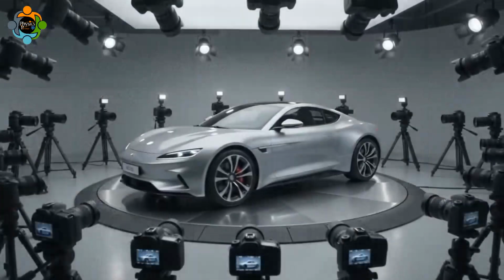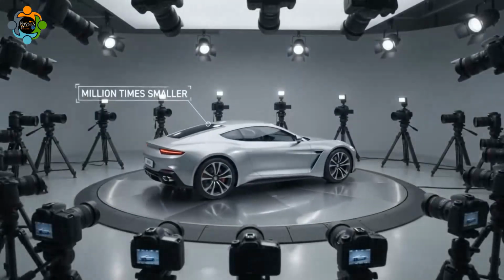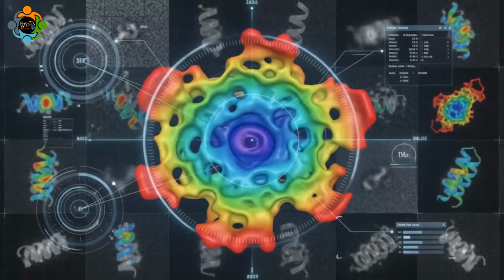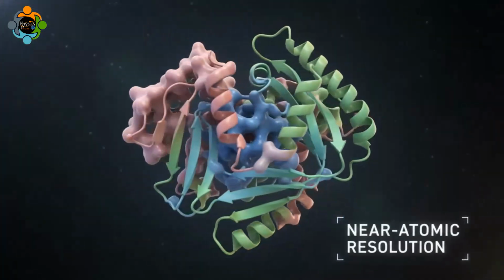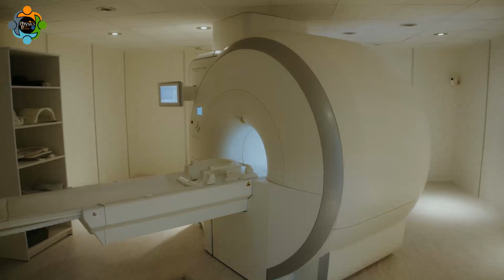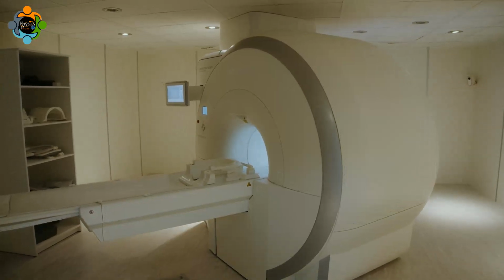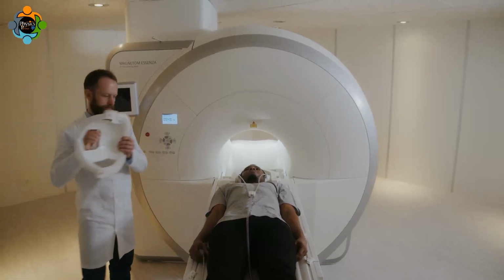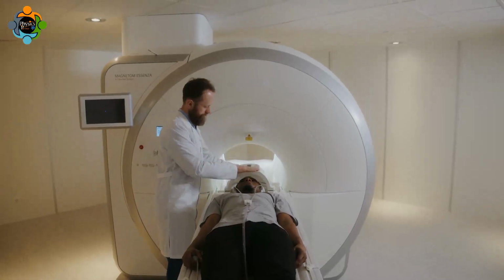It's like taking thousands of photos of a car from every single angle and building a perfect 3D model, but on a scale of a million times smaller. Finally, let's move from molecules to a living human with MRI. This is a beautiful example of physics applied to medicine that uses no harmful radiation.